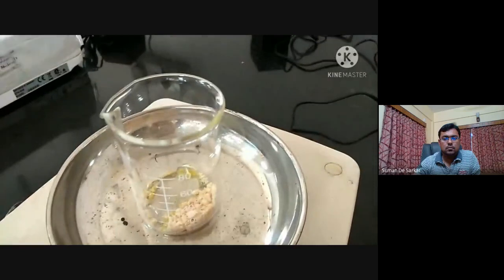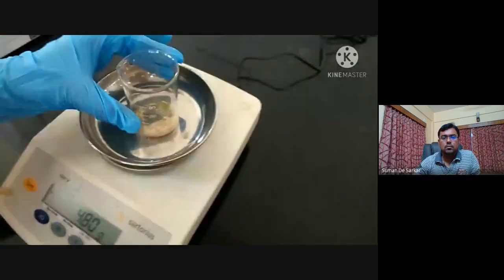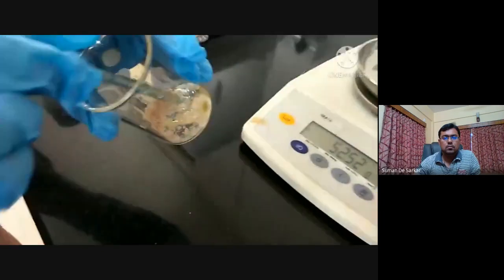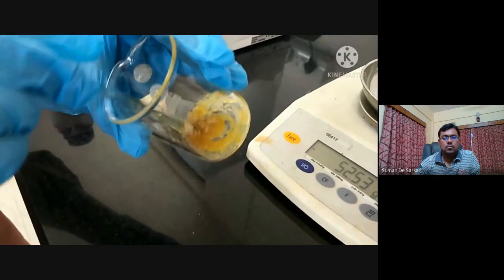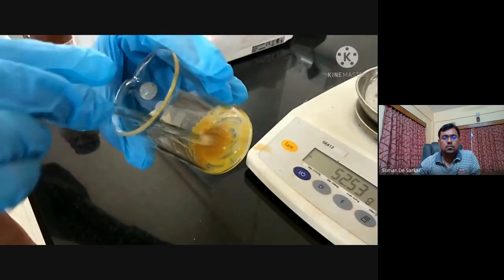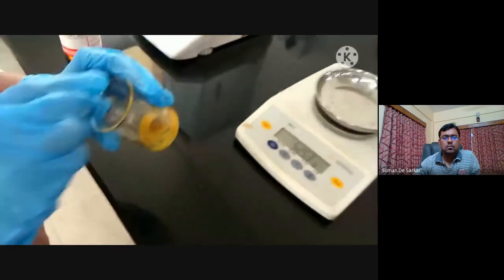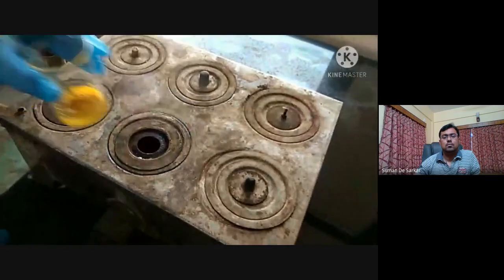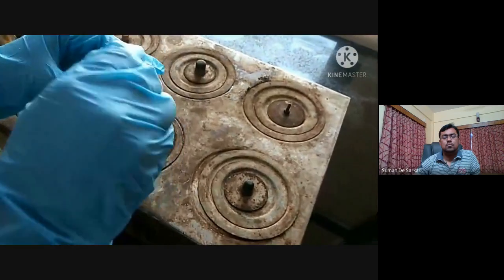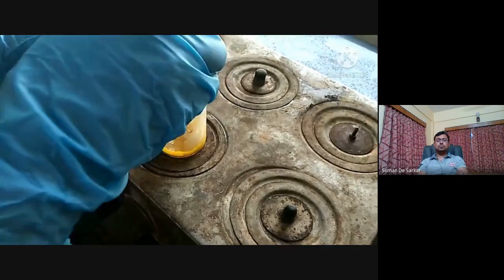I asked Nidhi to just tare the beaker here, take it out from the balance. Yeah, stirring here. So you get a viscous kind of reaction mixture. But for this Fischer indole synthesis rearrangement to take place, we need heating. We'll proceed towards the boiling water bath here for around 10 to 15 minutes, and then we'll show you the progress.